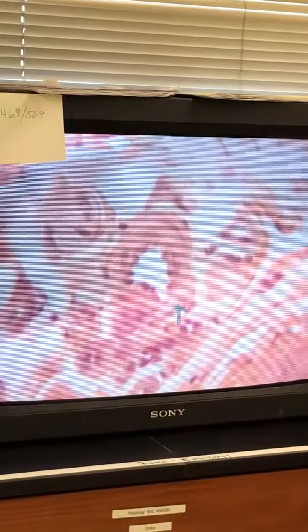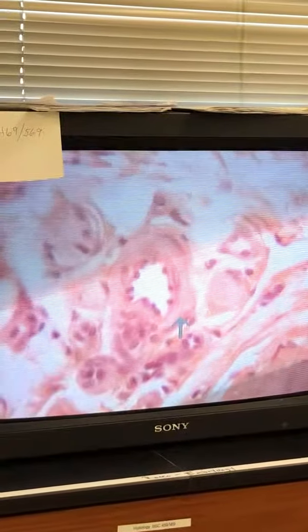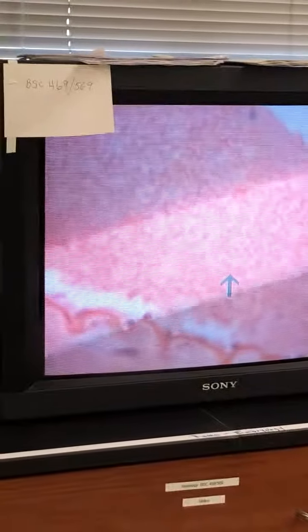Like this one, I could say, name this entire structure, and that would be an artery. I could say that at the very end. Name the vessel, correct? So you named all the parts, then I could say name the vessel, and it would be an artery.